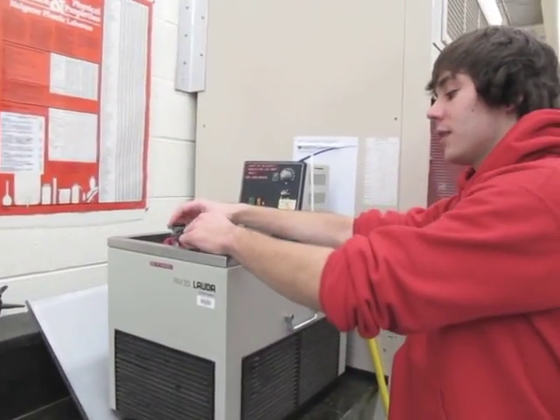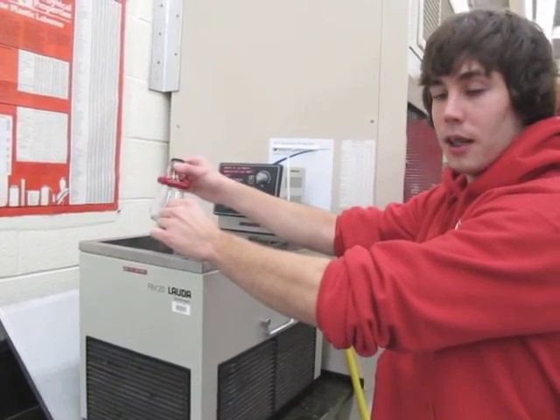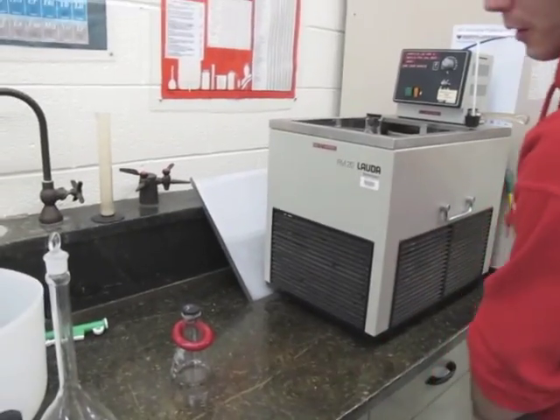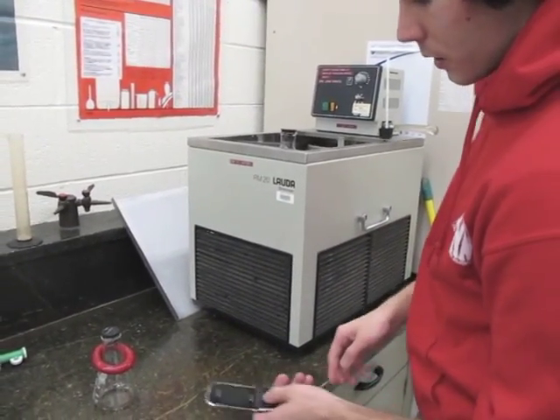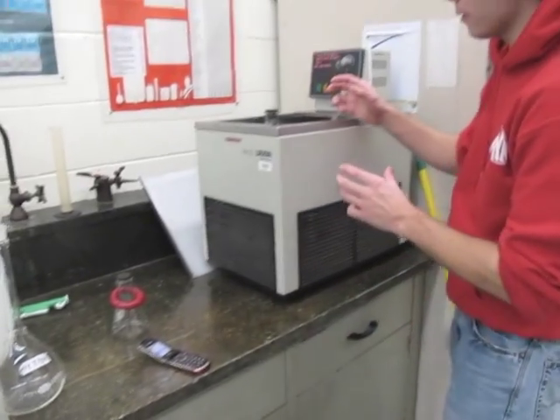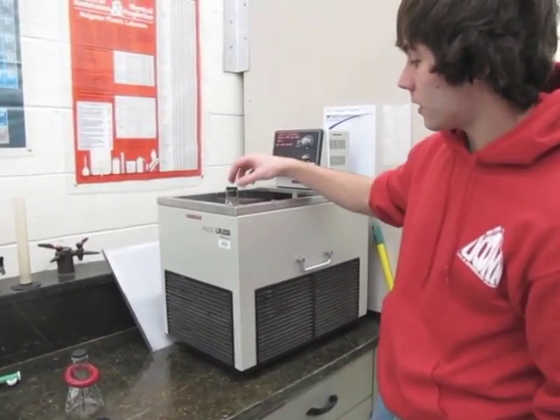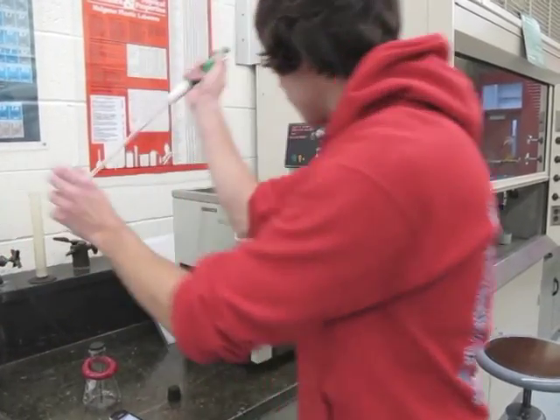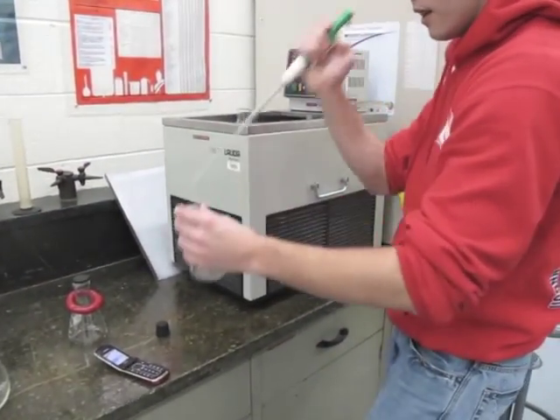After your initial titration, you're going to combine the contents of both flasks into one flask. At the same time, you're going to record the time that you combine them, that way you know how long the reaction is going for. Every two minutes, you're going to draw a 10 milliliter sample and then titrate it like you did the initial titrations.